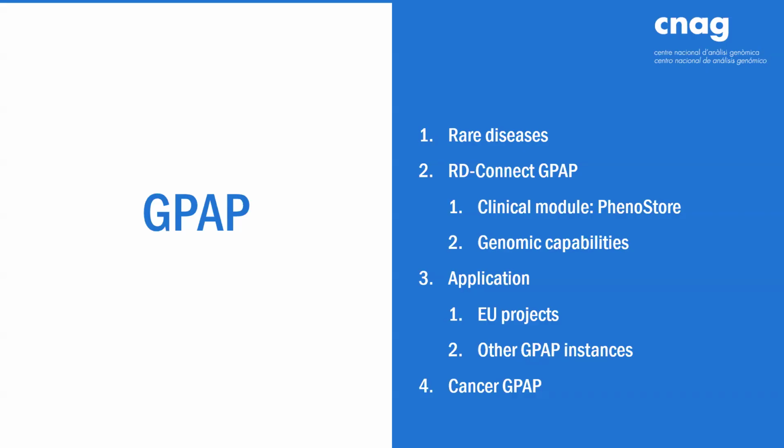And also an overview on other GPAP instances that are not the RD-Connect GPAP, but that are used in other environments, in hospitals, or to share data across regions. Finally, as I mentioned, and if the video works, I will show you how we have applied also as a backbone of this development for the cancer use case and somatic analysis.